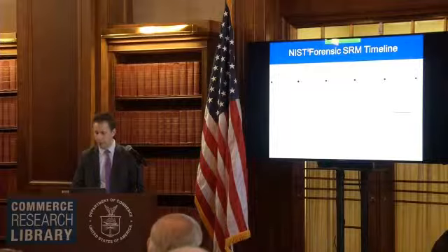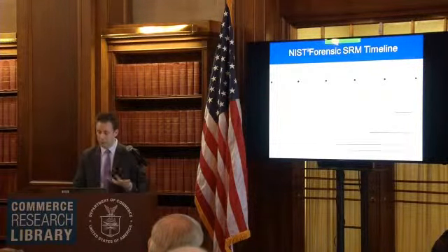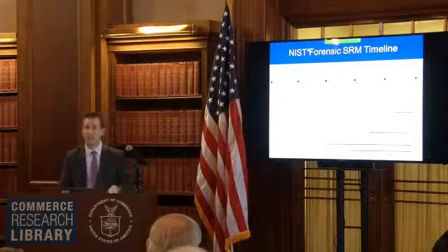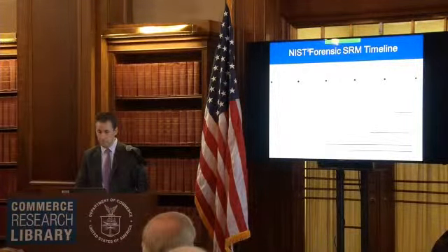And we have other materials out there. There's one for Y chromosome typing. There's one for quantitation, for calibrating your quantitation, and there's also ones for mitochondrial DNA as well. So we have sort of this suite of genomic DNAs that have been characterized at these genetic markers of forensic relevance.